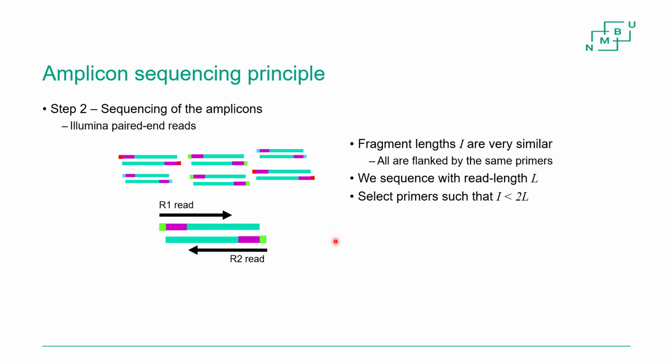That's the idea. So when it comes to fragment length here, they're all pretty similar and they should not be long. When we talked about fragment lengths for full metagenome sequencing, at least if you're going to do assembly, you should try to have a little bit long fragments so that the reads don't overlap.